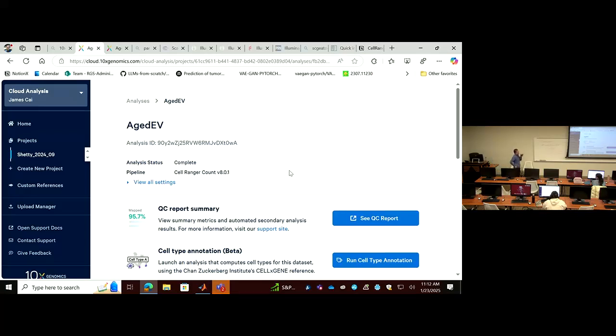While you are waiting for the analysis to finish, I can spend more time on this QC summary report. That will be the one you first check once you finish the mapping and get back the results.